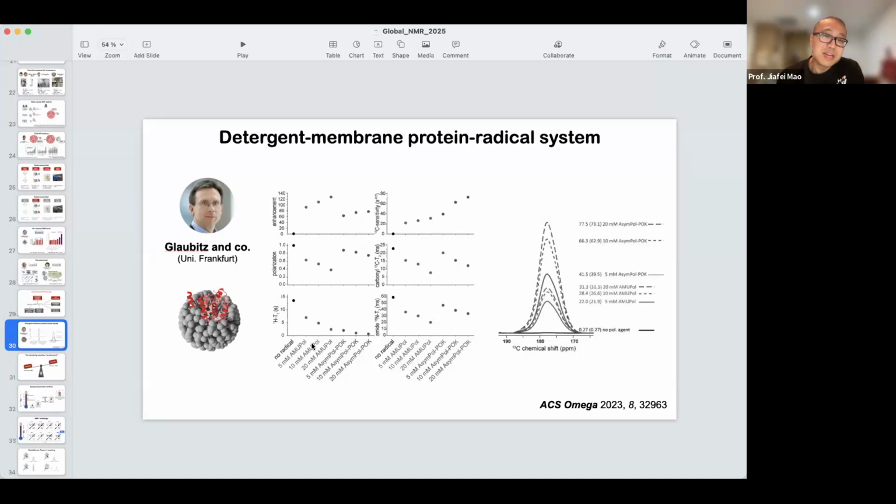And the enhancement, as I said, on the proteoliposome pellet is actually the same. So all this information then goes to Johanna, and she had a system which is very precious, so it really needed some optimization on the model system. That's why here you can see the crazy optimization on the concentration, deuteration, and different recipes.